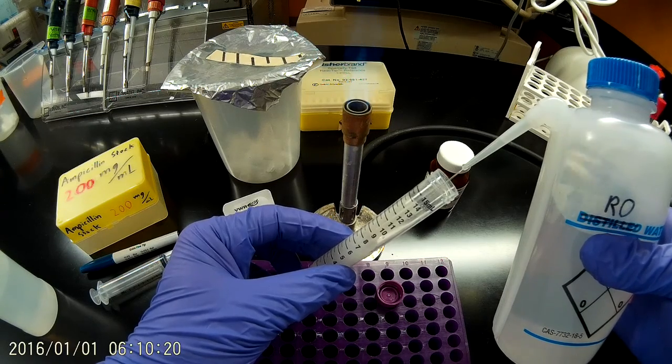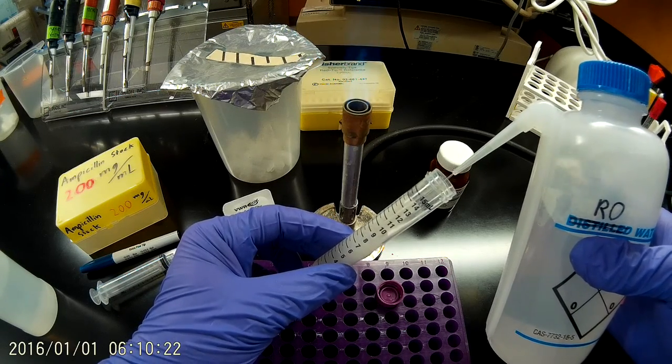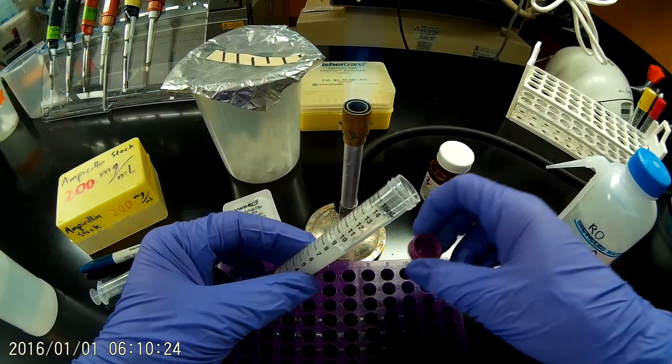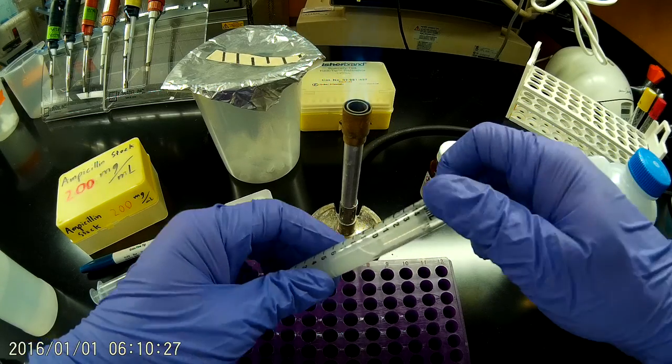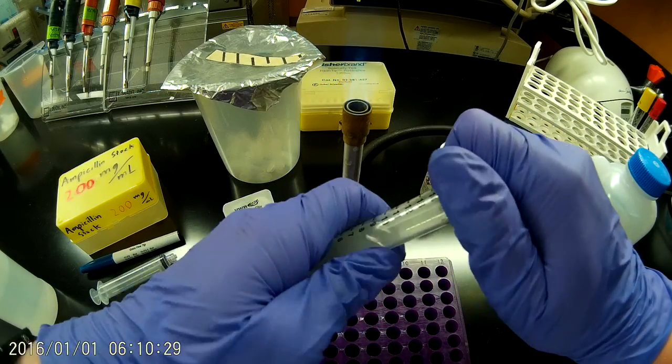So remember, I've measured out 2 grams of ampicillin powder here. To make a 200 milligrams per milliliter solution, I'm going to want to adjust this to a final volume of 10 mils.